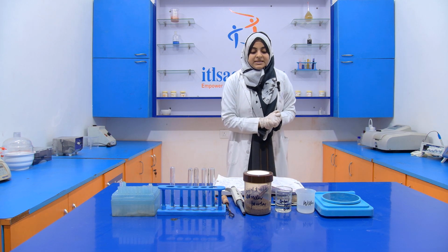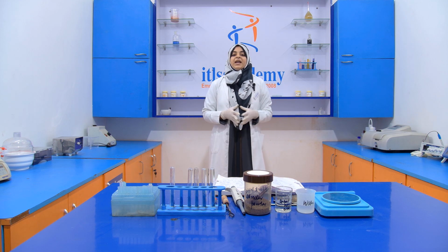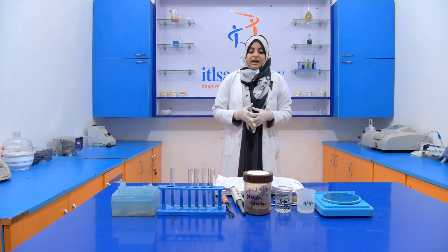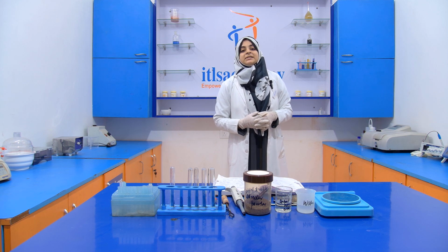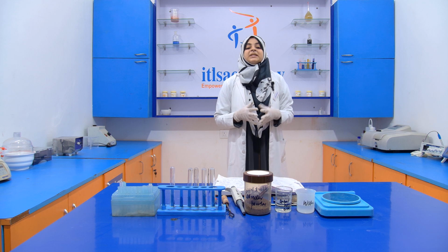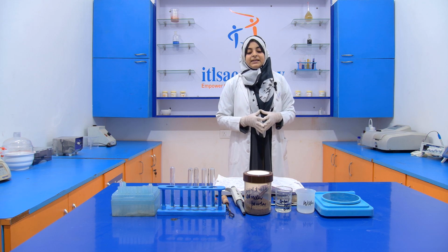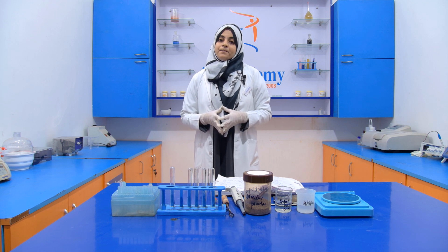Now how do we perform this experiment? We take 1 gram of coriander powder. Then we add 3 ml of water. Then after that, we add 1 to 2 drops of silver nitrate. If we get a white precipitate, then it indicates that common salt is present in the coriander powder.